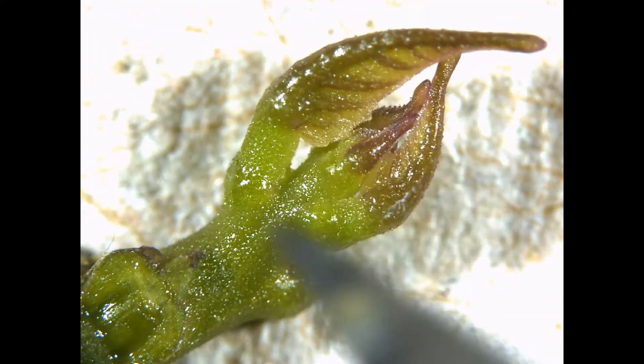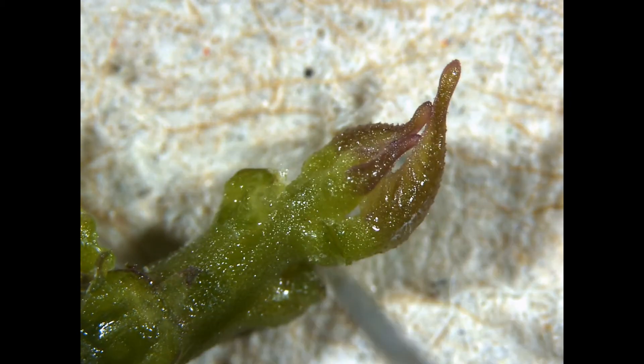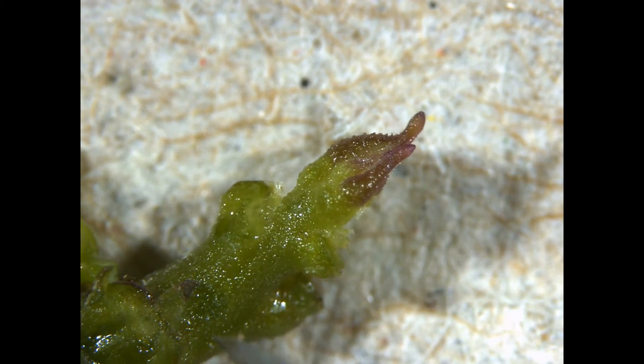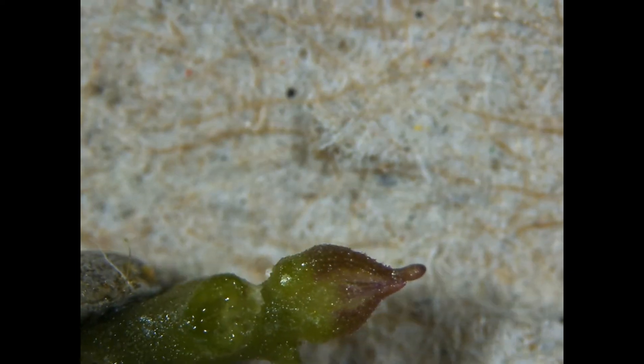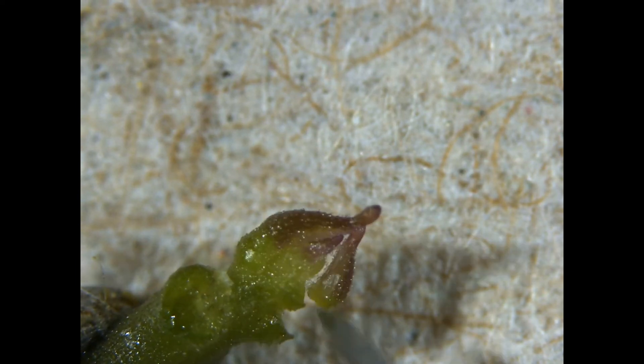Sweet potatoes are one of the easier plants to meristem. It's relatively easy to locate the meristem dome and they're very vigorous and grow well in tissue culture. Slava is very practiced at this and her technique is really excellent.